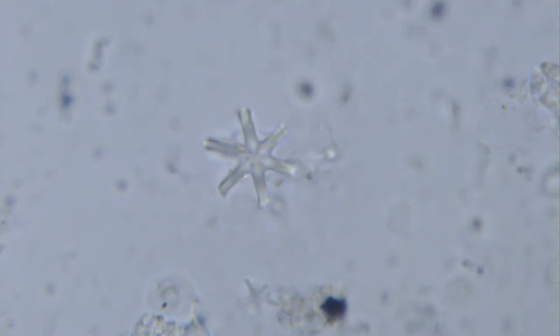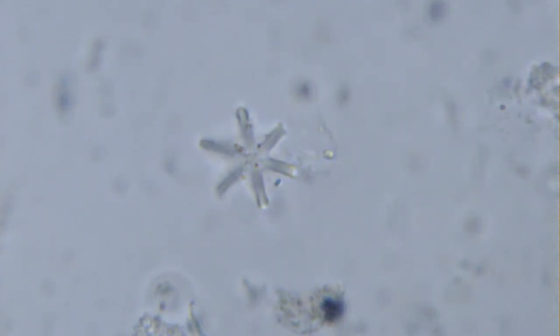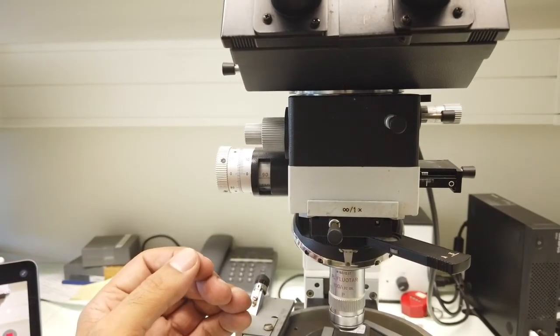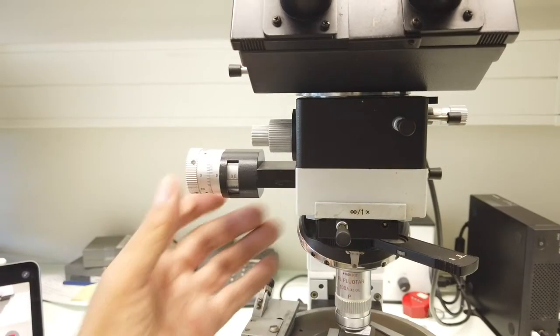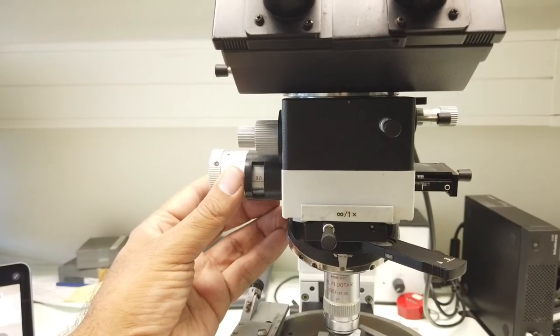Here we have a case in which all crystals of this radial stellate calcareous nanofossil of the genus Discoaster are V units. In these circumstances, the microfossil is better seen in parallel polars or parallel nicols because when you change to cross polars, it disappears. Well, not completely. It might leave a ghostly profile that reveals its presence. This is why we are almost constantly inserting and removing the analyzer when we are screening calcareous nanofossil assemblages, for instance, in a smear slide.